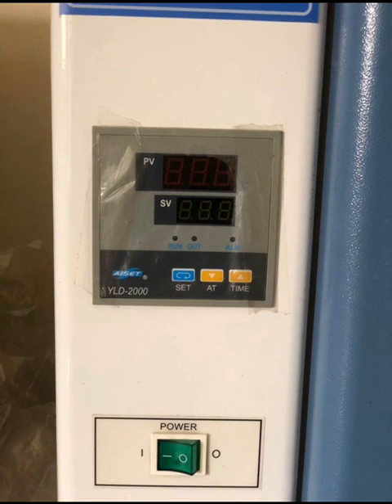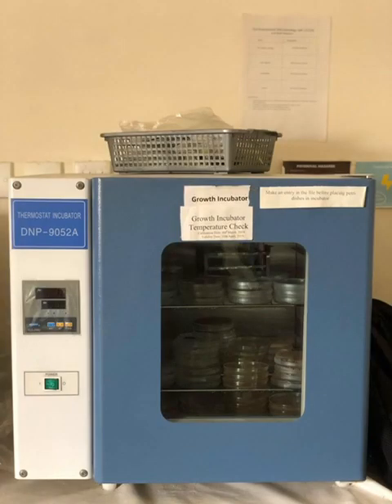PV stands for process variable and SV stands for set point variable. These terms are commonly used in control systems and automation to describe the variables involved in maintaining a desired condition or set point within a system, such as temperature, humidity, or gas concentrations in the case of a growth incubator. The process variable refers to the current value of the condition being controlled or monitored within the system. For example, in a growth incubator, the PV could represent the actual temperature, humidity, or gas concentration measured inside the incubation chamber at any given time.